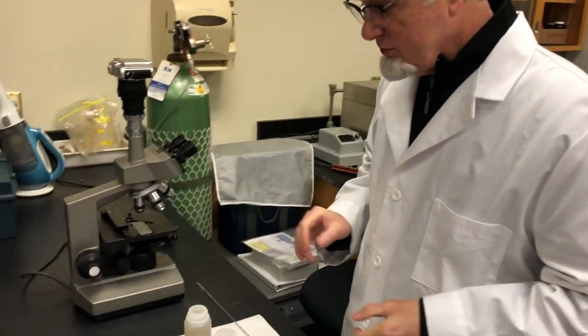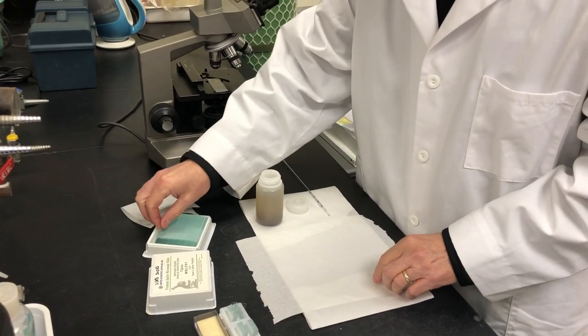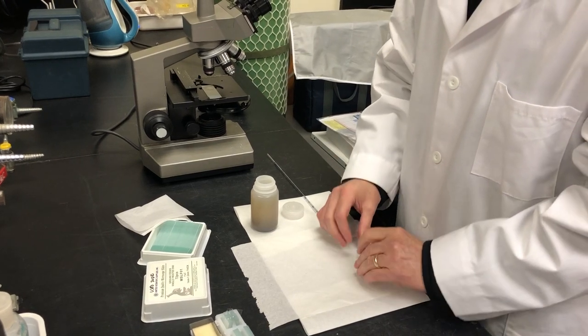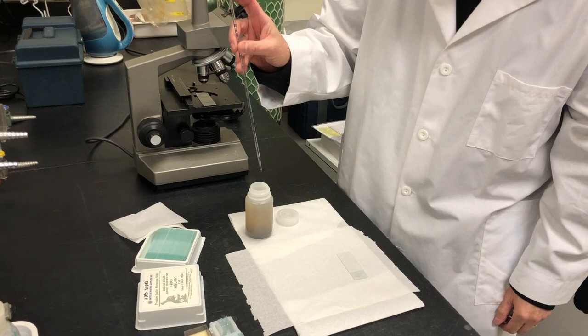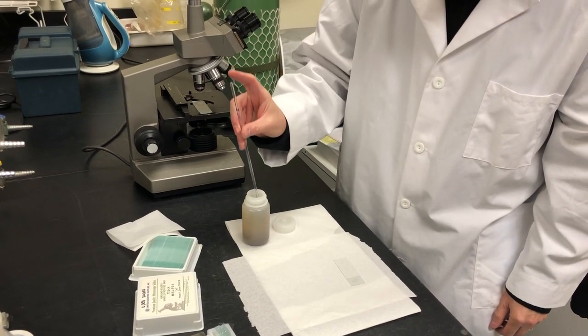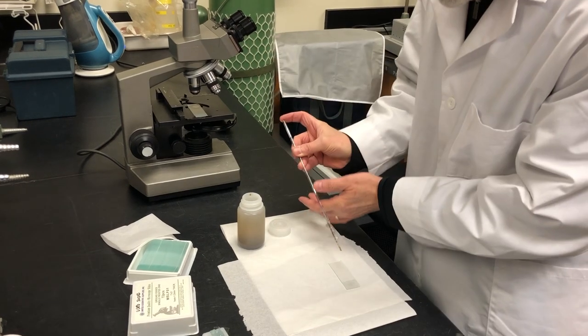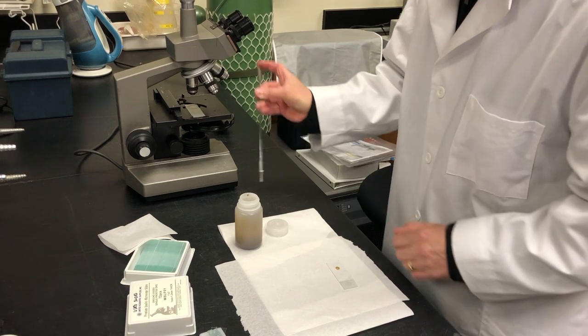Hello, today we're going to show you how to do a simple wet mount. What you're going to do is you're going to want to take a clean microscope slide. Then you're going to want to take your settled sample and you're going to try to dip your pipette down into the solids if you can, because that's what you're looking for, and you're going to put a small drop onto the slide.